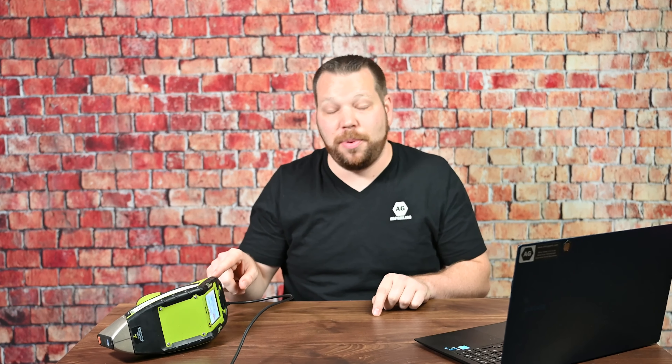The first thing you're going to want to do is plug the USB port right into the analyzer — that's on the back side here. I've already done that for the sake of this video. Of course, the other side goes right into your computer. I've got my laptop up here so I can show you how this is done.